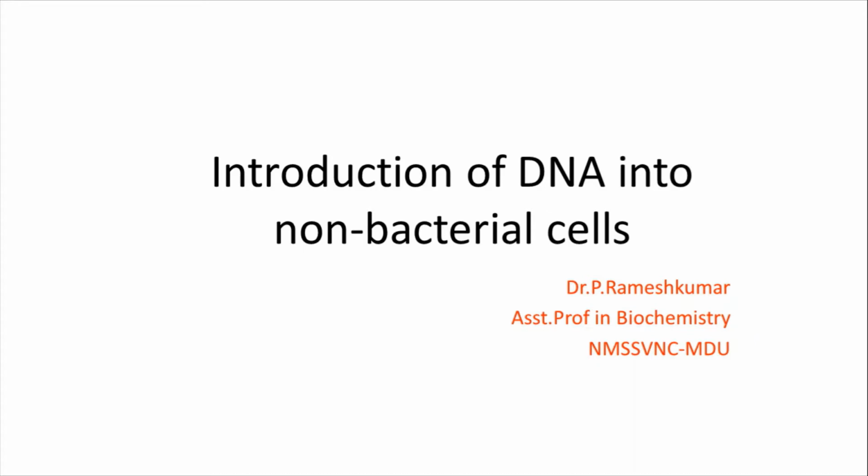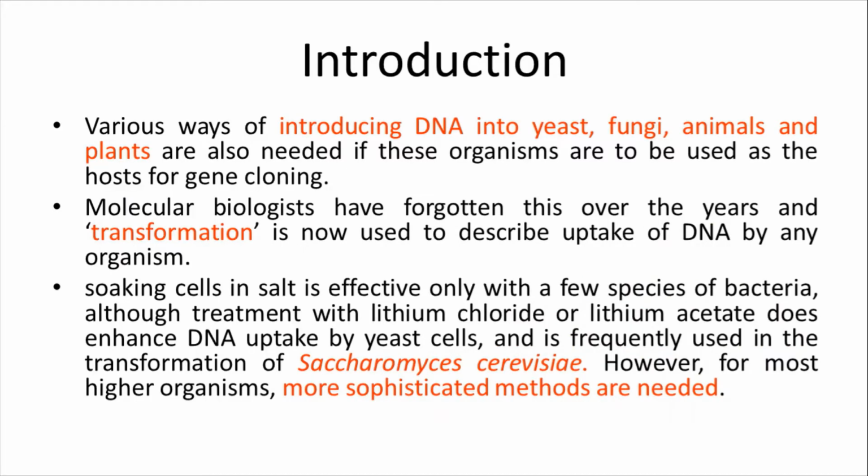Various methods exist to transfer the DNA into the host, namely electroporation, microinjection, and particle bombardment or gene gun method. The gene gun method is a very famous method, now recently used.